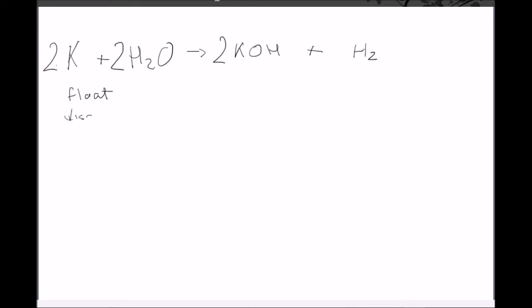The metal, if you looked at in both instances, disappears. The universal indicator, just write UI, turns, and again green, as I've always said, always give the initial colour and the final colour. So it goes from green to purple. Of course you get a fizzing.